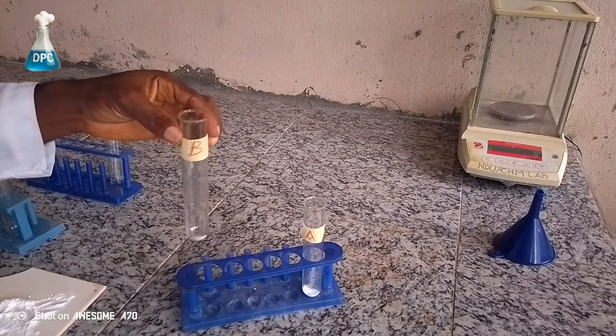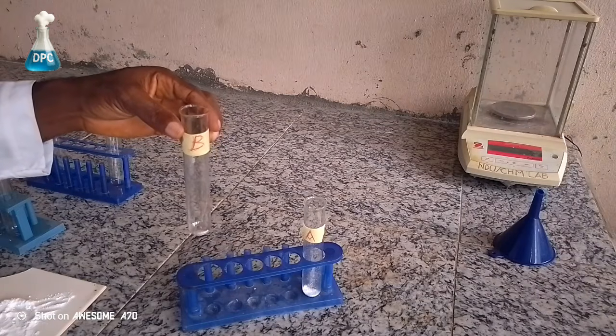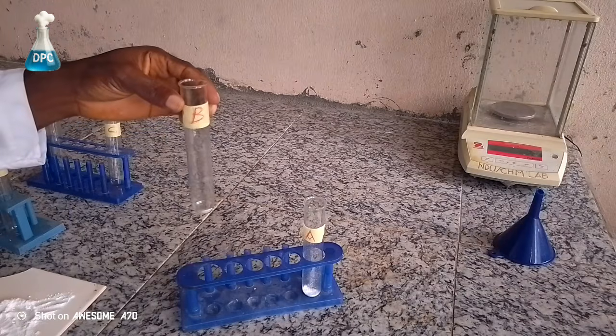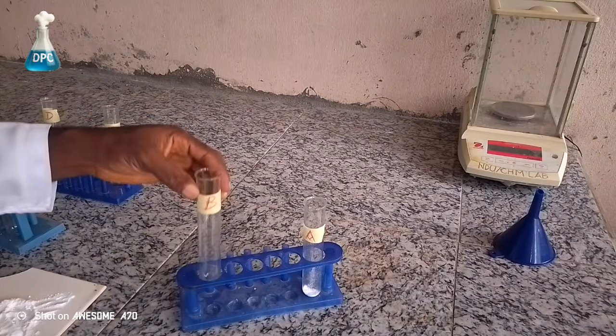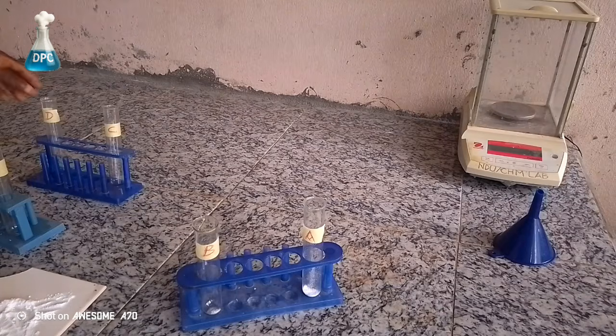Okay, now we are done with that. Now we can load the third test tube, which should be test tube C.